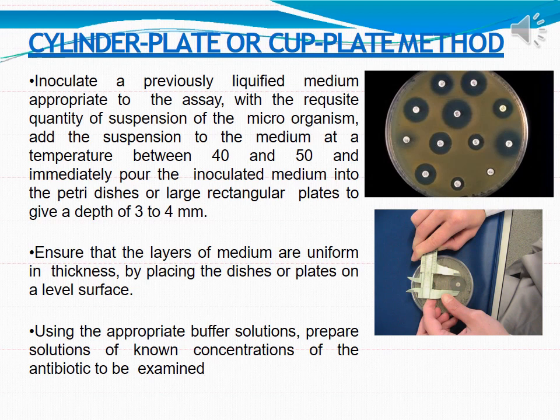Okay. Now let's move to the name. That is why this method is called the cup and plate method. Whatever holes you have created in the petri dish become your cup, and your petri dish itself is called a plate. Hence the name, cup and plate method.